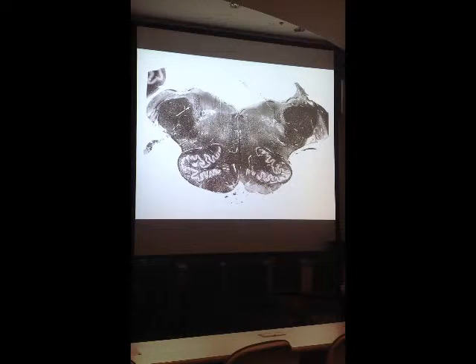Okay, so we go to this slide, folks. Again, one question will be to name a section through the brainstem, so you might as well get it right. This represents a section through what part of the brainstem? It's medulla. It's pretty obvious. You should know that well.